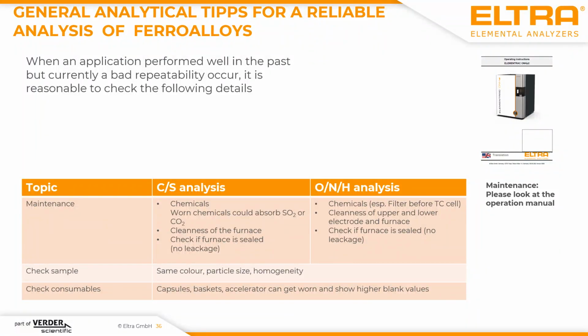One other thing is also the cleanness of the upper and the lower furnace, and here also a leak check is recommended to test if you lose some gas. These things are very important when you get irritating results on a known application.